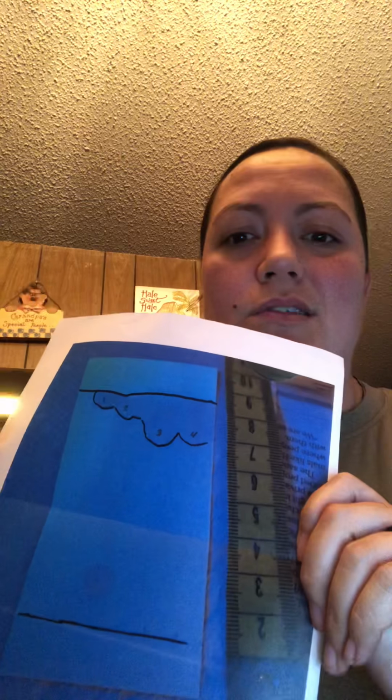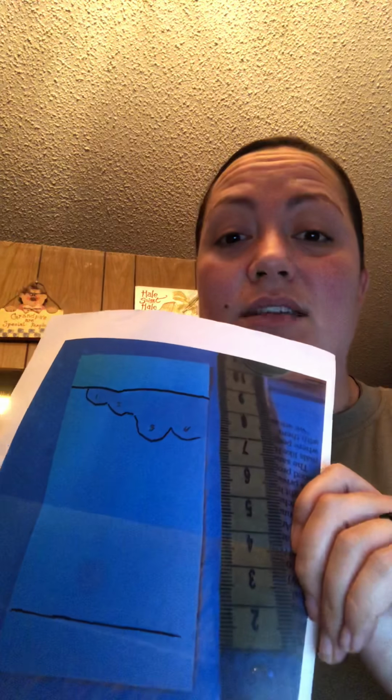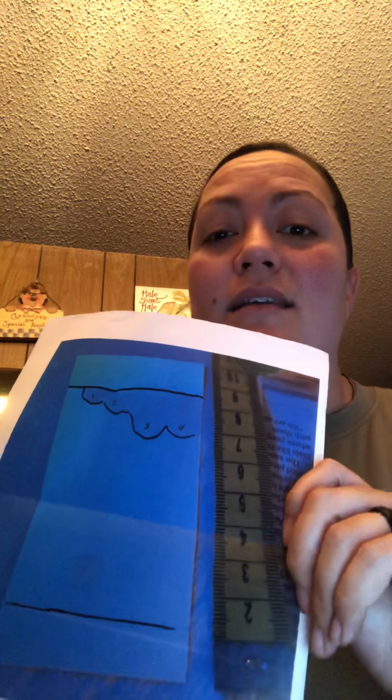In looking at my table, I can see that the RF values for spots 1 and 2 are similar, and spots 3 and 4 are similar also, those 2 pairs. So I'll talk about it as I go through my TLC plate. Clearly this is not the actual TLC plate, it's a picture, and it's not a very good picture either, but I imagine looking at a smaller TLC plate it would be difficult, and I outlined the major stuff in black and talked through it.